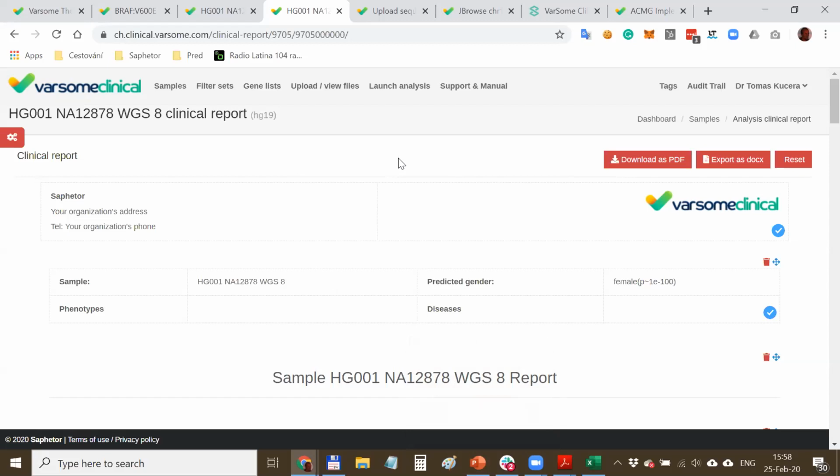And I think what you mentioned, Tomas, about those earlier stages being relatively straightforward is very true, as long as, with the Swift Amplicon workflow for example, they're able to work through the protocol accurately. Sometimes there's only 2 steps in the Amplicon kit, but sometimes a small mistake can be made. We have a technical support team that can get you through that stage if you have any issues. And then, like you said, the generation of the sequencing data and even the variant calling steps are relatively straightforward.